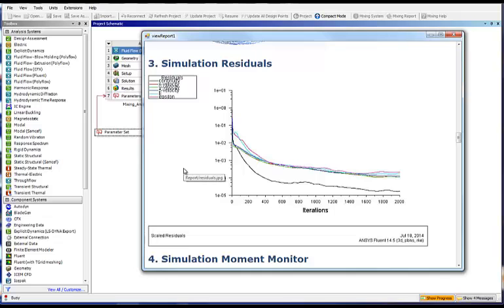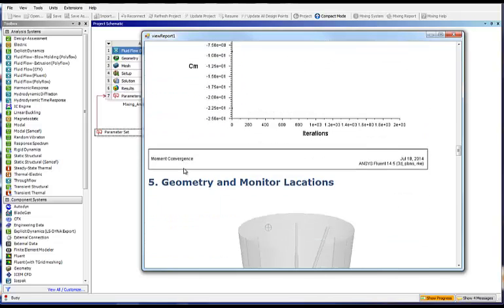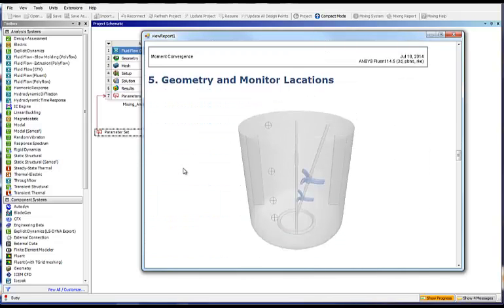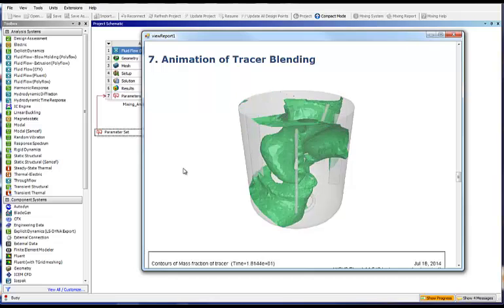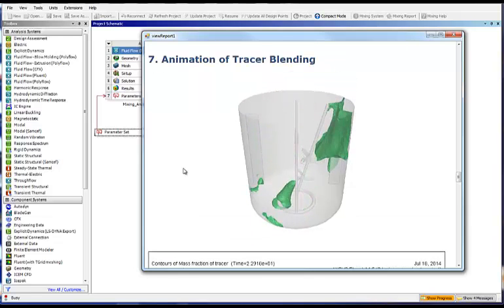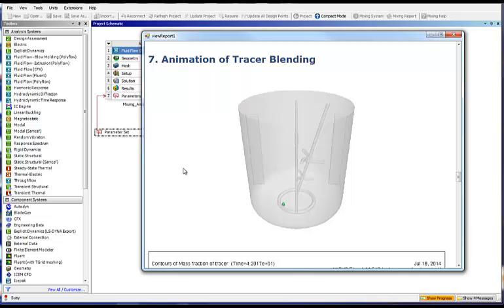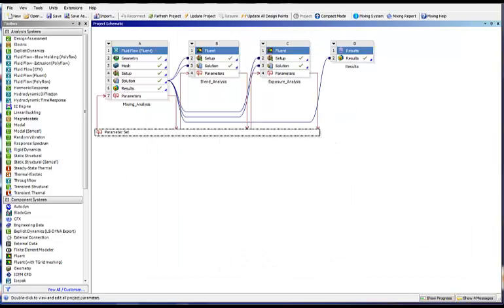You can check your residuals to make sure your simulation is well converged. And here again the animation of the tracer blending that we saw at the beginning of the presentation. So really an easy way for you to look at the performance of your design.